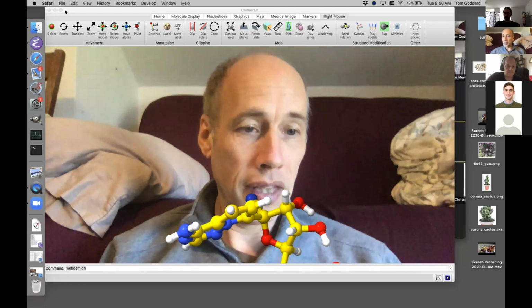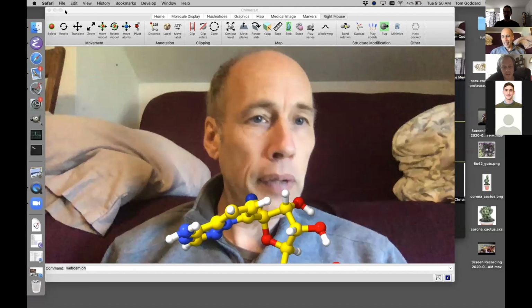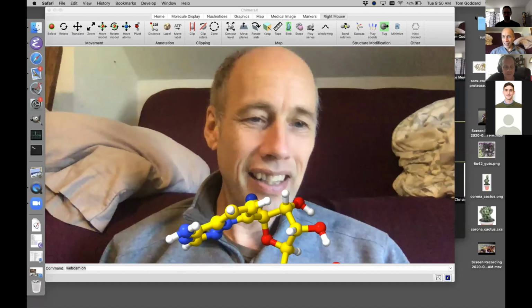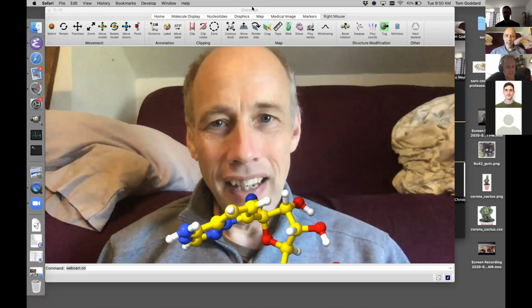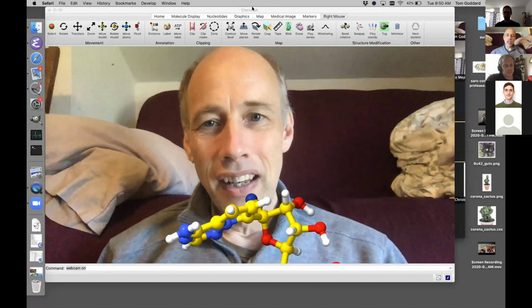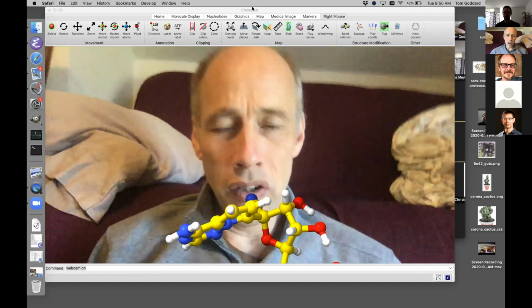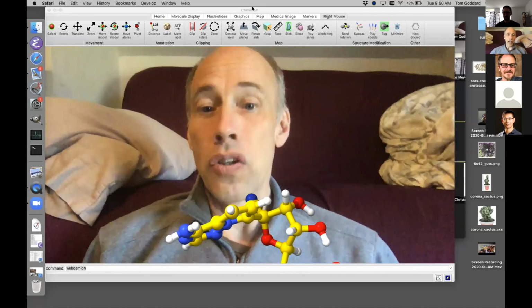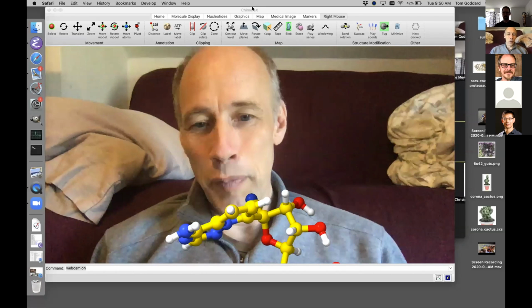Cool. Other questions? Well, on that same note, I've seen people doing VR on Ubuntu systems at hackathons and things, but I don't have a lot of experience with it. You're using Windows. Is that just because it's more stable, tried and true, easier to do? Jason, did you say you've seen them use VR on Linux? Yes, ChimeraX VR can work on Windows or Mac or Linux.